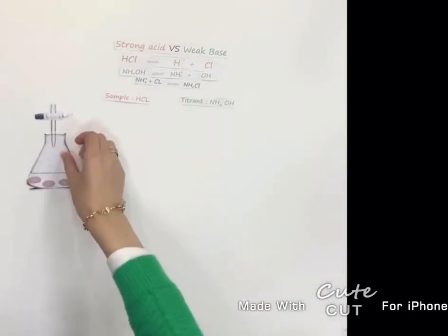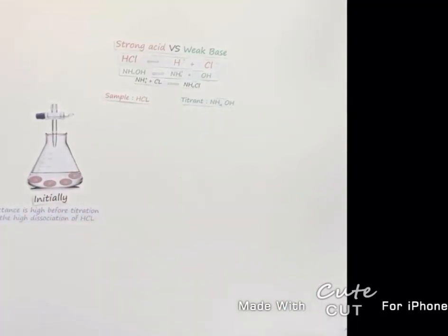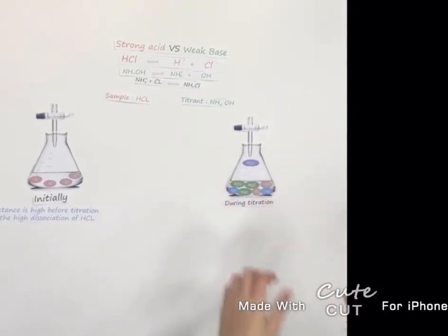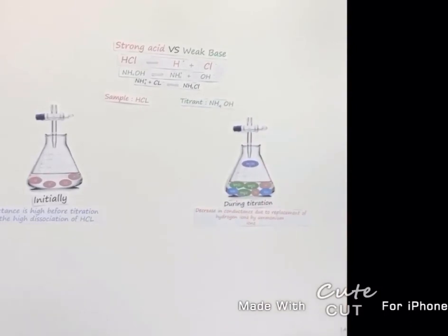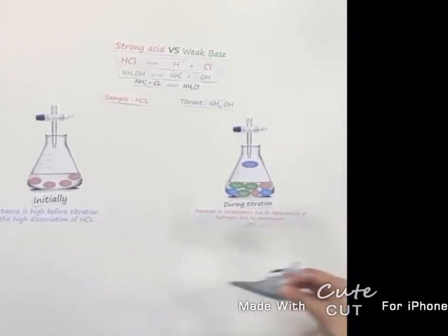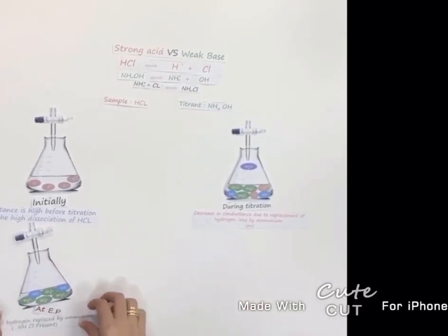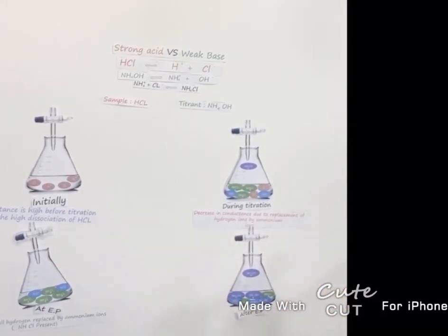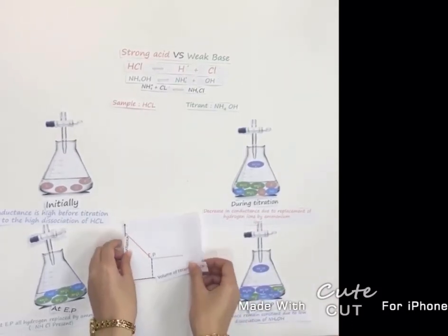Before titration, conductance is high due to the high dissociation of hydrochloric acid. During titration, conductance decreases due to replacement of hydrogen ions by ammonium ions. At end point, no hydrogen ions are present due to replacement by ammonium ions. After end point, conductance remains constant due to low dissociation of ammonium hydroxide. And this is the curve of the reaction.